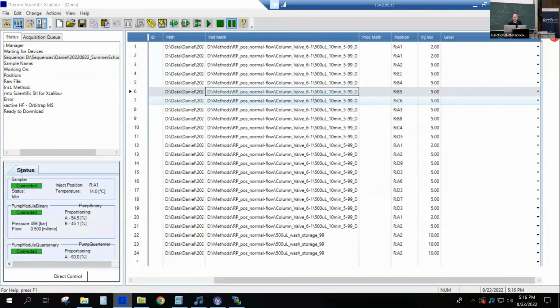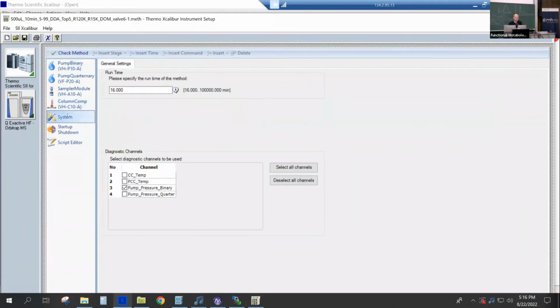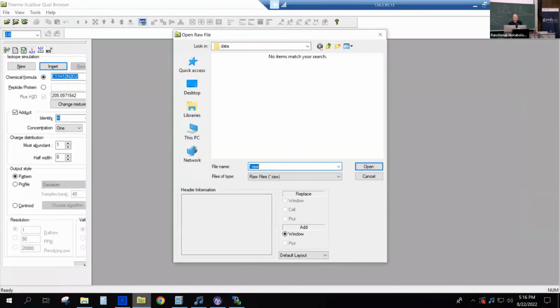And that tells you a lot about your equilibration time and whether your pump works well, because any pulsation you will immediately see. We recently had problems with our check valves, and monitoring the pressure is perfect to take a look at it. So again, here it's check C pump binary pressure. And it's really nice if I show you the sample I just acquired earlier before it leaked.